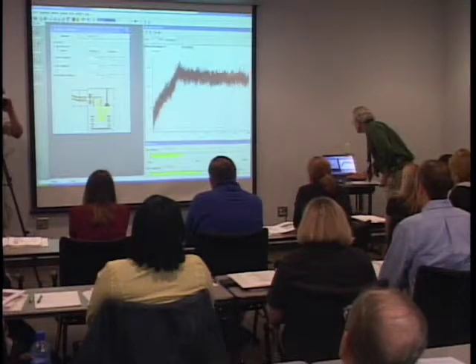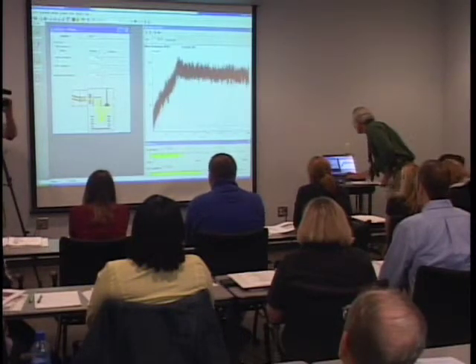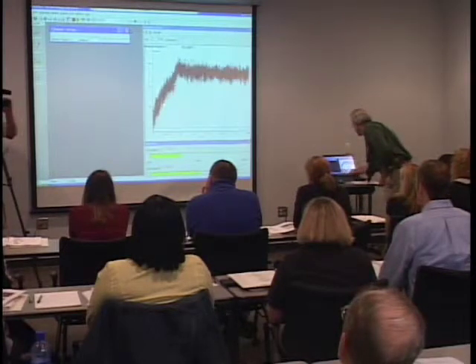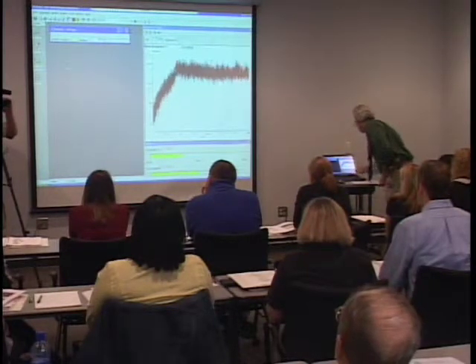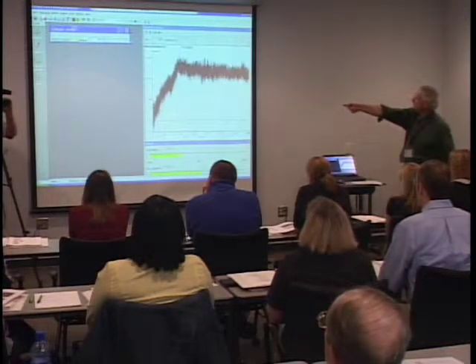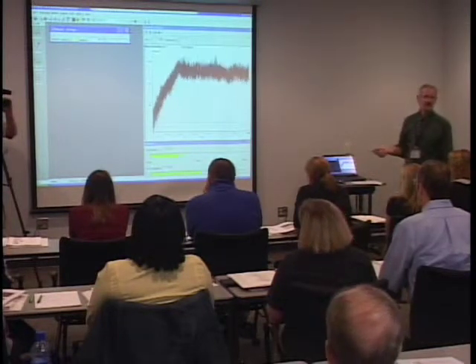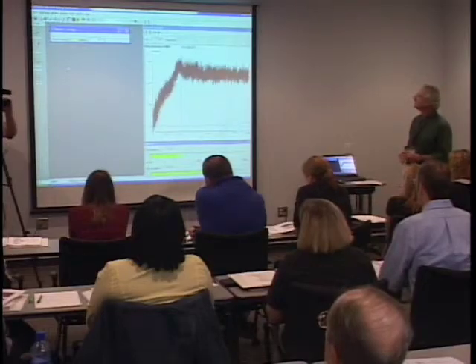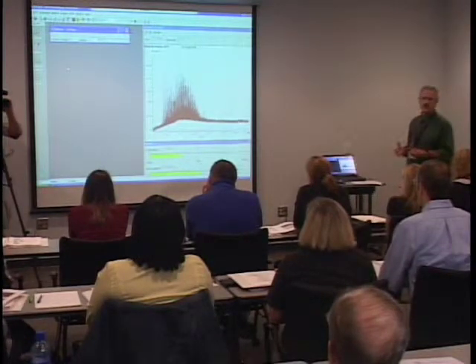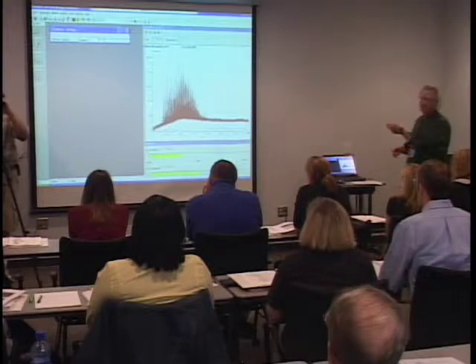Let's check if the detector is off. We want to set the voltage to about 2600 volts. If you see something that's yellow, that means it's changing. As soon as it's white, that means it's stable. Now the detector is on and you start seeing some background. This is actually low-level background. When we put a sample in front of this, it will be a whole lot stronger.